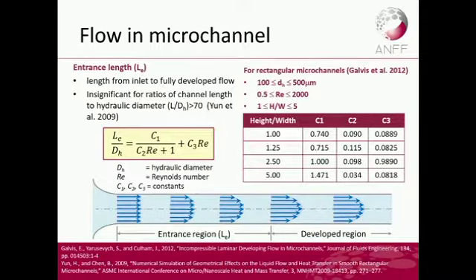So, flow in channel. Now we're moving on to what if there is fluid flowing in the channel? What do you need to look out for? In the design of a microfluidic device, before you start running experiments, it's probably worthwhile to take a look at the entrance length.